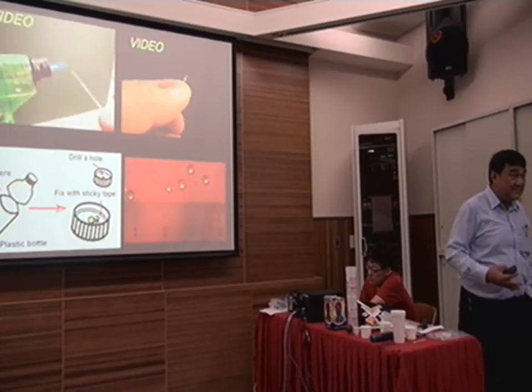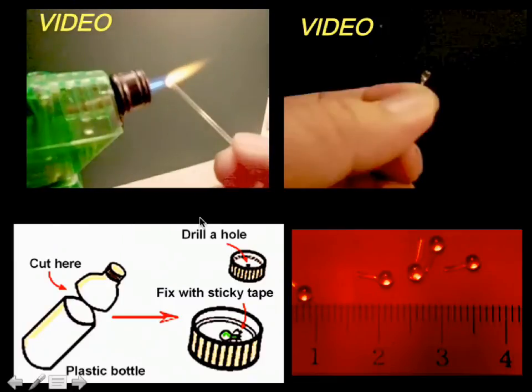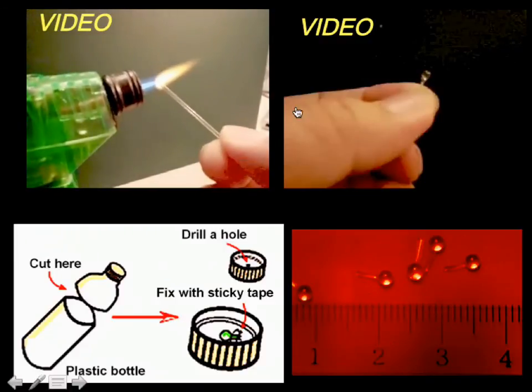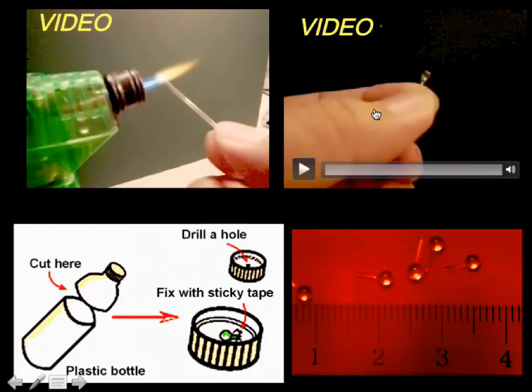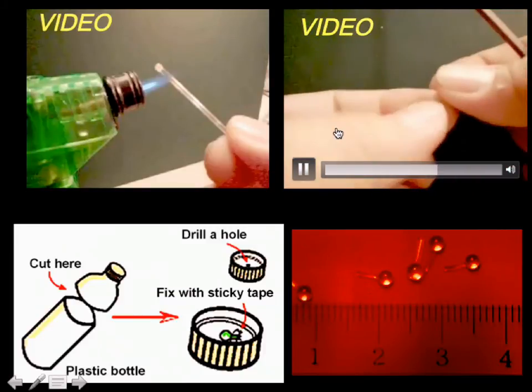Now we can do the same thing as Robert Hooke. We melt the glass rod for a while — let's say 15 seconds — then we get the glass bead, like that. Then cool it down, and cut using a file, and break it.